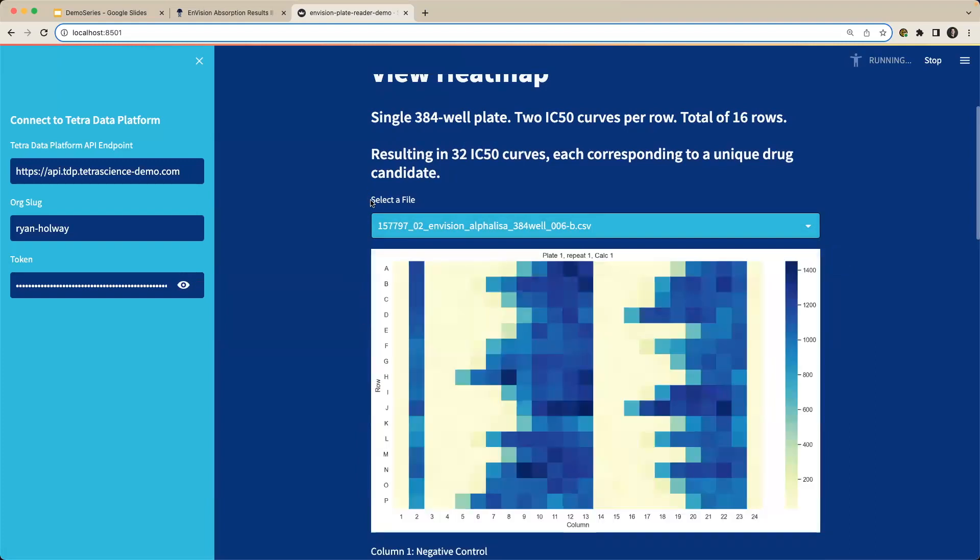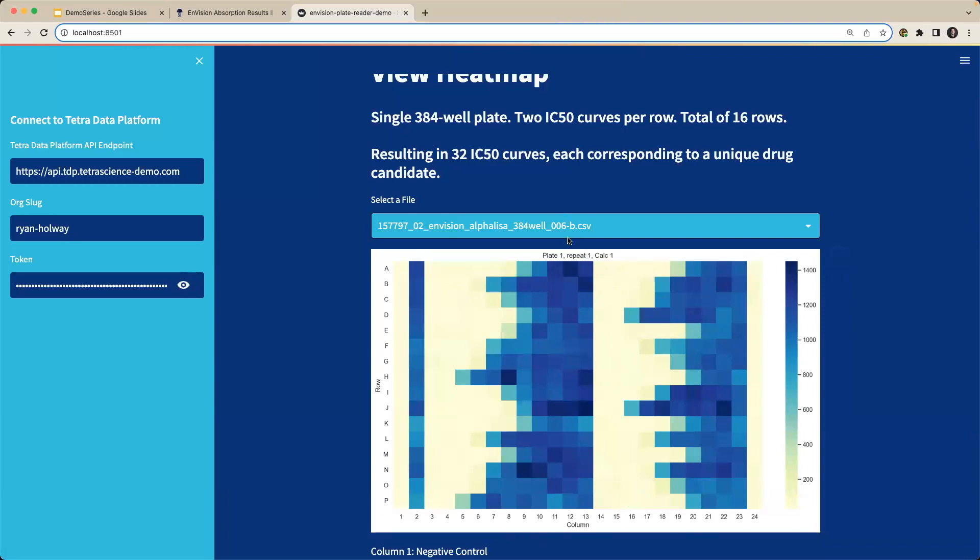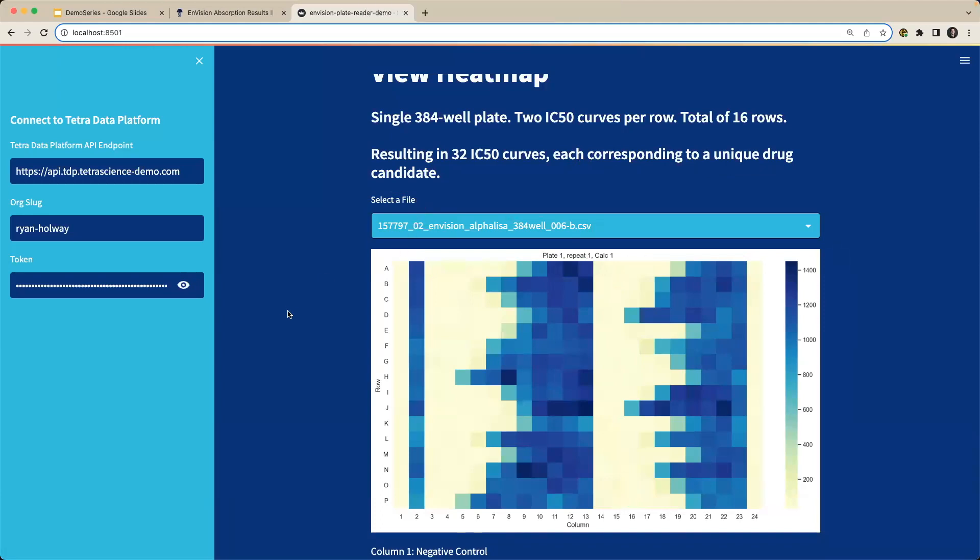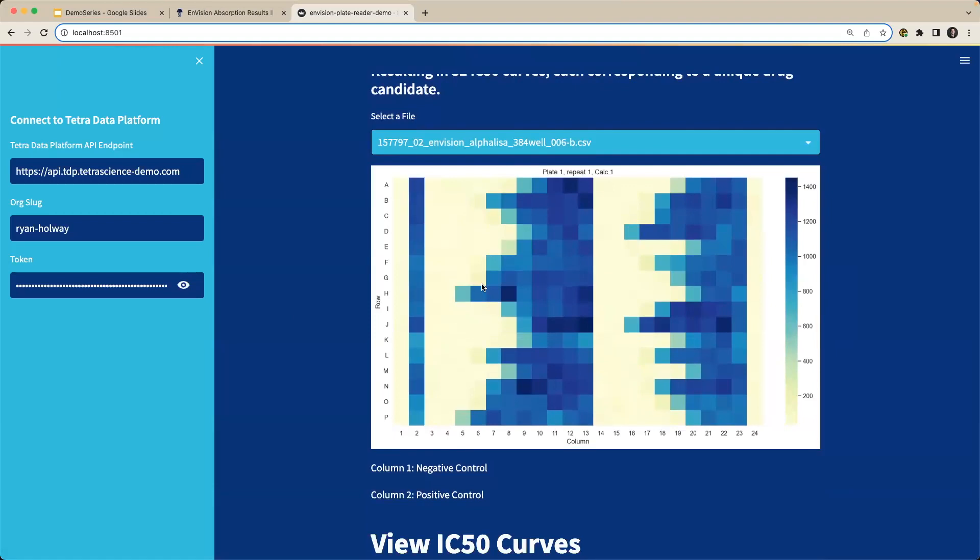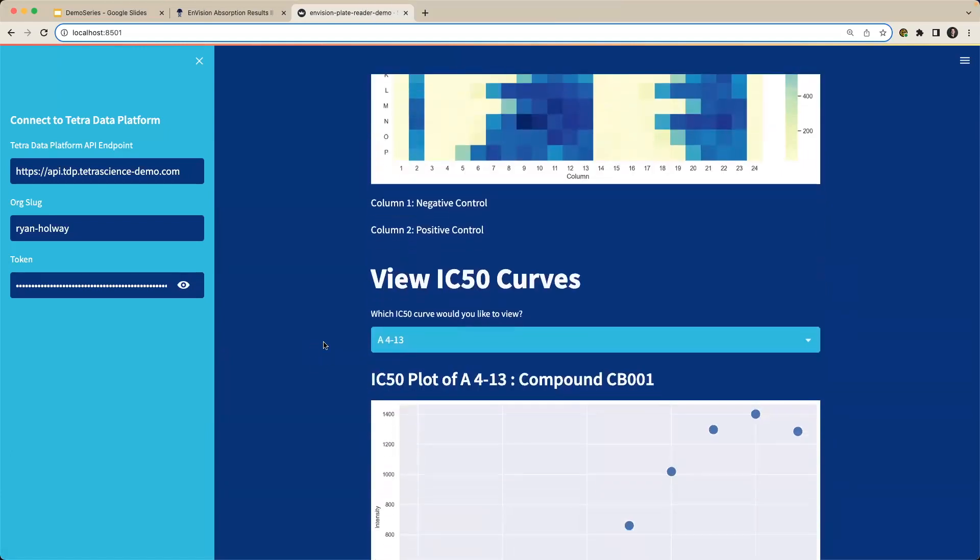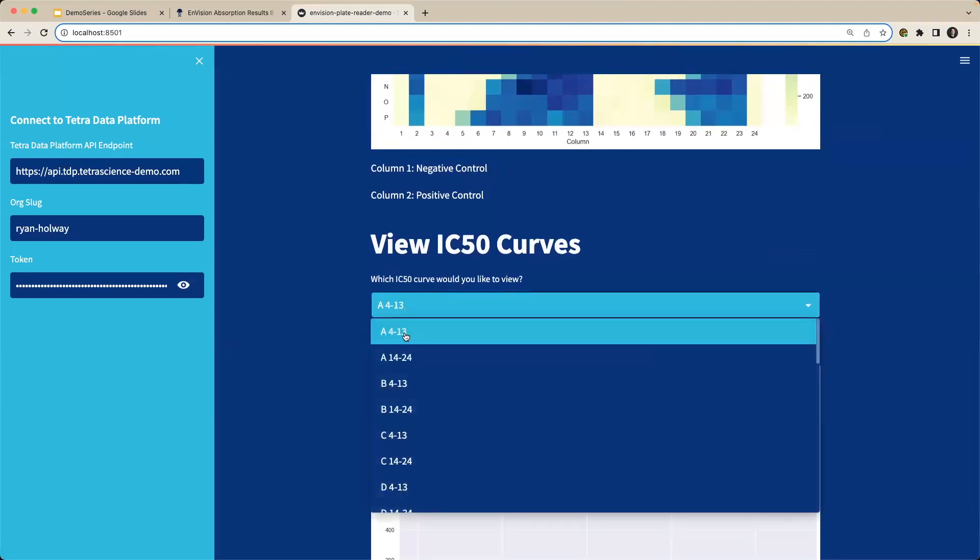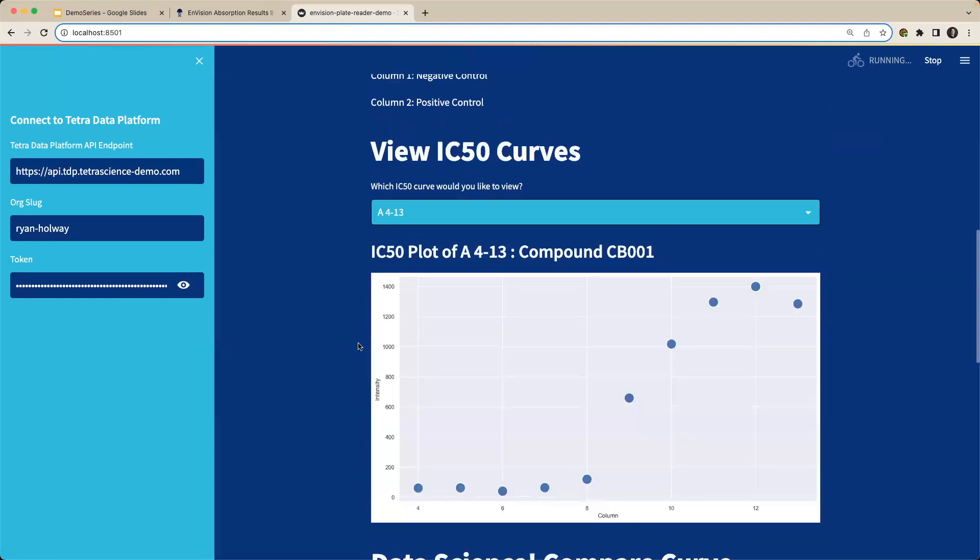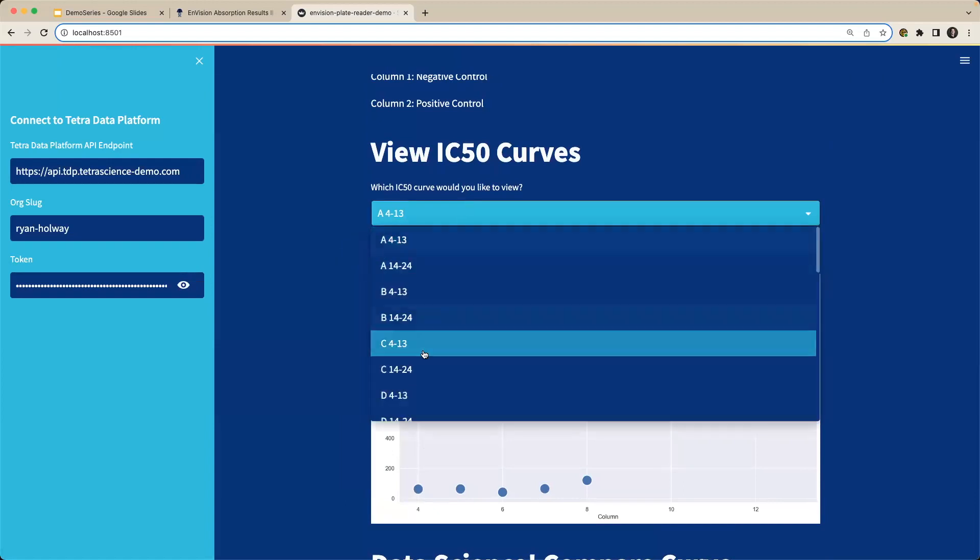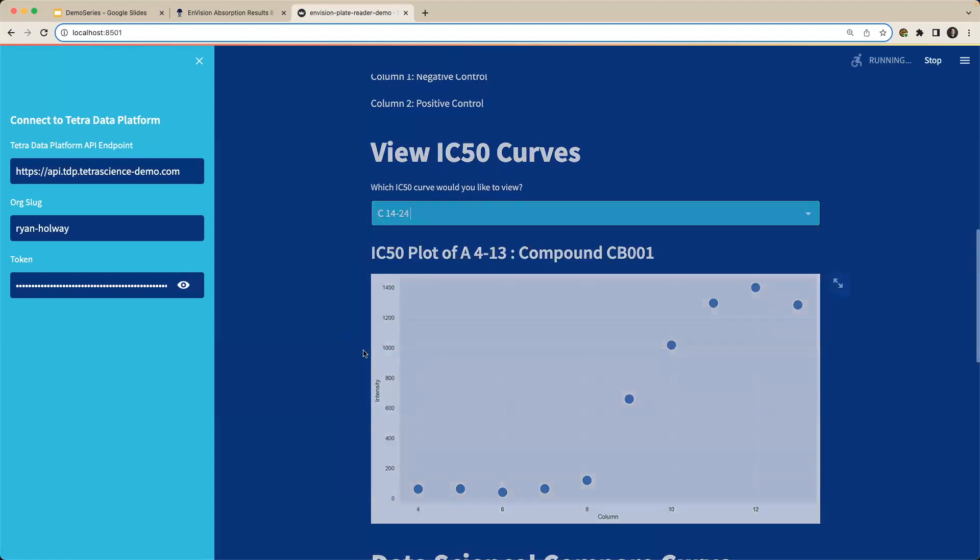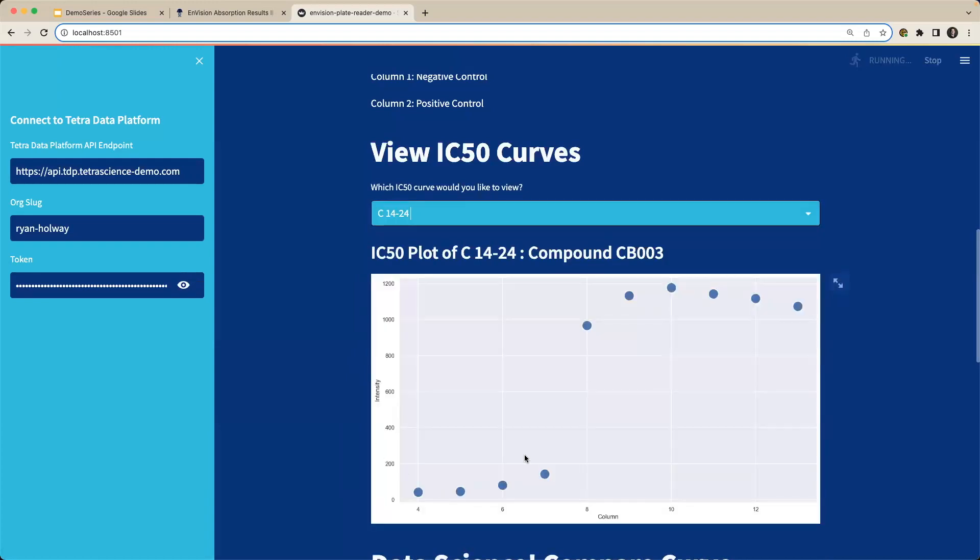We're looking at a single 384 well plate where we have two IC50 curves per row that we're looking at with a total of 16 rows. Each IC50 curve corresponding to a unique drug candidate. So if I'm viewing my heat map, let's say I'm interested in my IC50 curve on my A row. So I can scroll down and select my A row for my IC50 curve. And automatically I can view that IC50 curve. I can view another curve if I'd like as well. And we can see this is automatically populated with my updated curve.